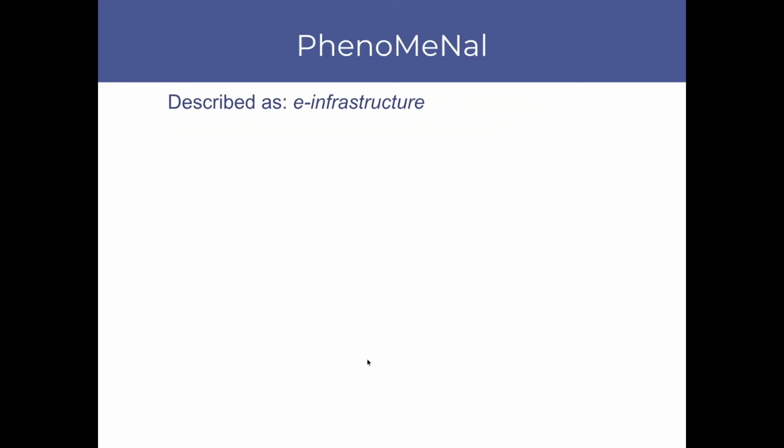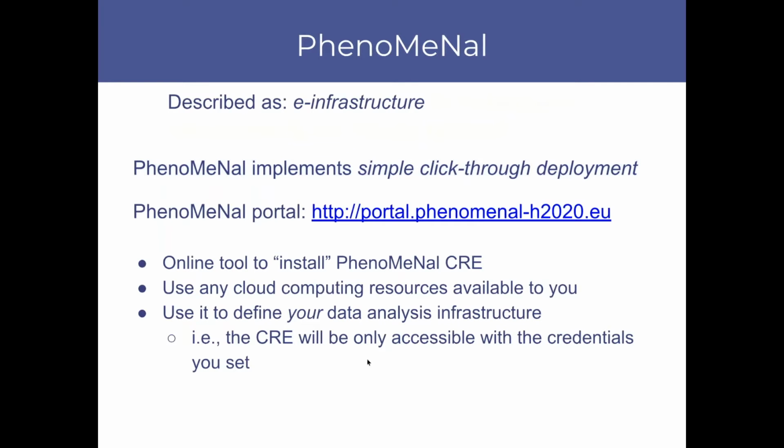The other part of the description, the e-infrastructure part, deals with the fact that PhenoMeNal implements a simple click-through deployment mechanism through its portal. That means we have an online tool, the PhenoMeNal portal, that you can use to install, so to speak. We also say deploy in technical jargon. So to install the PhenoMeNal CRE on any cloud computing resources that are available to you. This means that you can use it to define your own data analysis infrastructure in the form of a CRE that will be only accessible with the credentials you set as you deploy it.